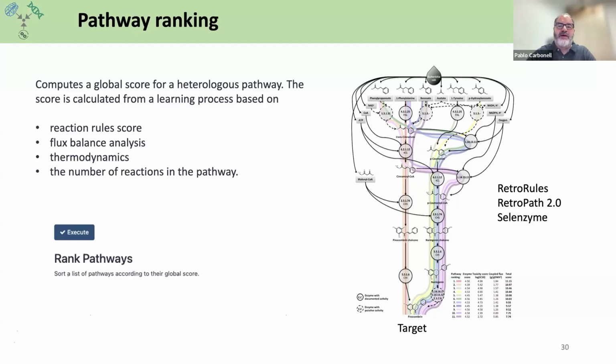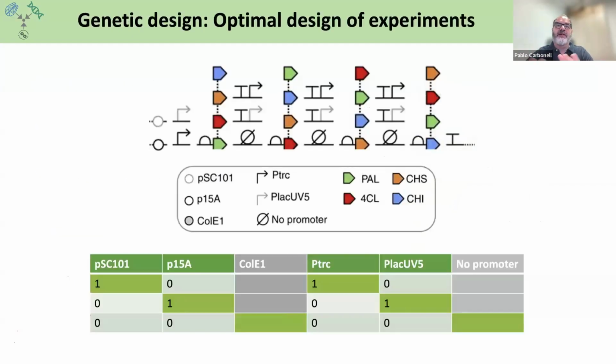So from the wet lab point of view, once you get this output from the Galaxy platform, it generates a collection of instructions with an experimental design like the one that you see here, telling which DNA parts need to be combined and in which way, like which promoters, which plasmids, which RBS, ribosome binding site, and gene sequences in which order, and promoter exchange.